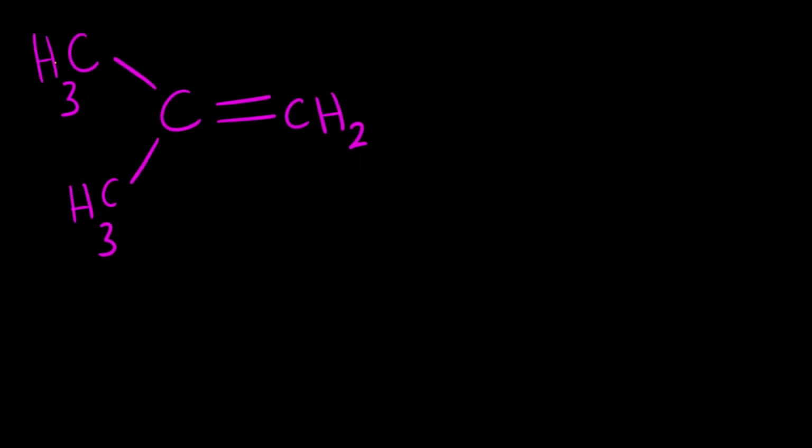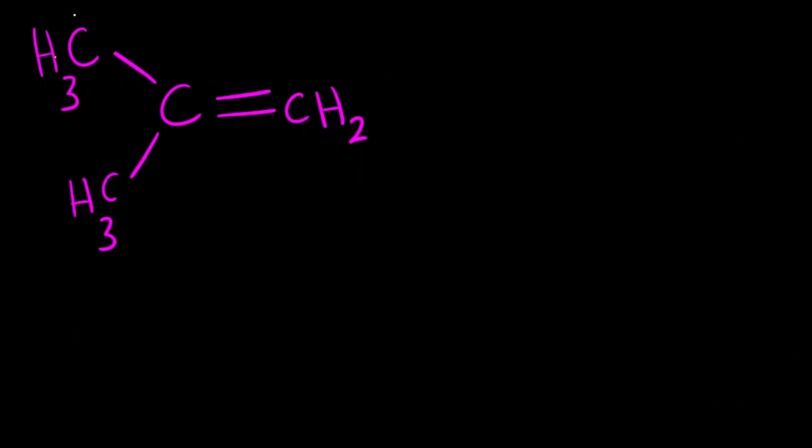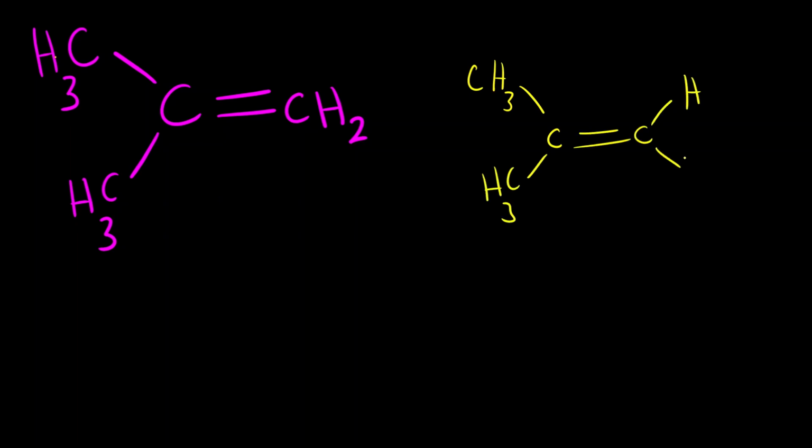Now, suppose this one. Here again you have to see the chemical bonding in the alkene. I can draw this molecule like this: CH3, C, CH3, double bond, C, H and H. Now you have to see the chemical bonding again. CH3 is attached to carbon, but again you have to see the stereochemical relationship here.